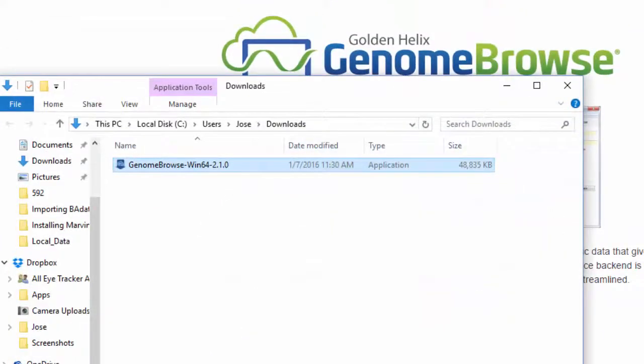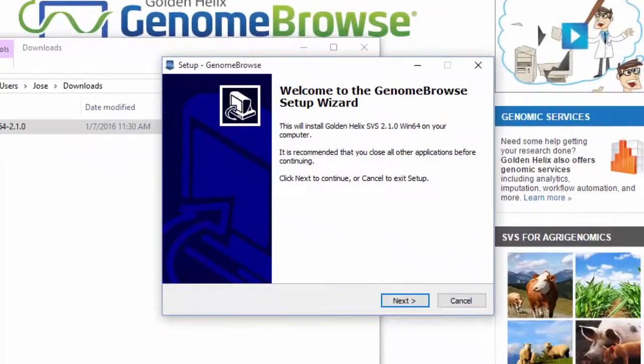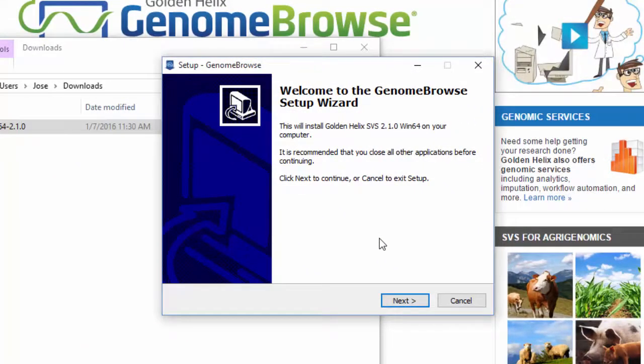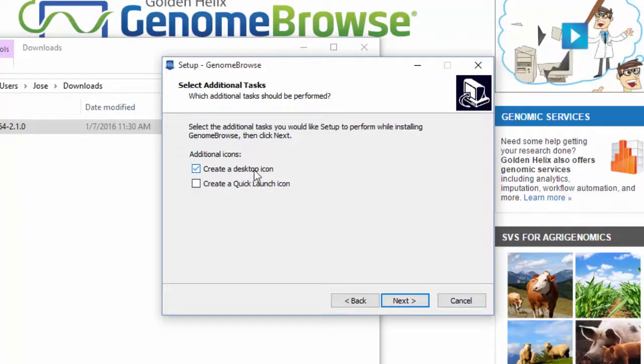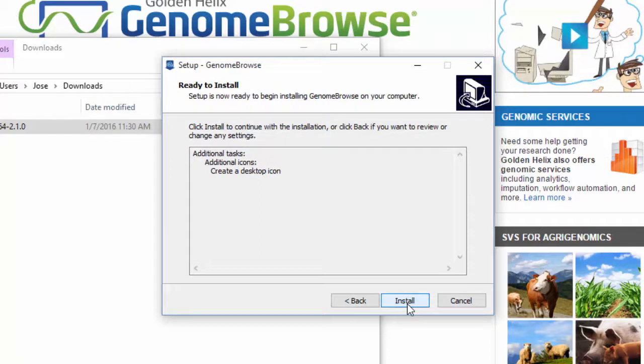Initiate the installation, click Next, and check the box to create a desktop icon, then select Next, and click Install.